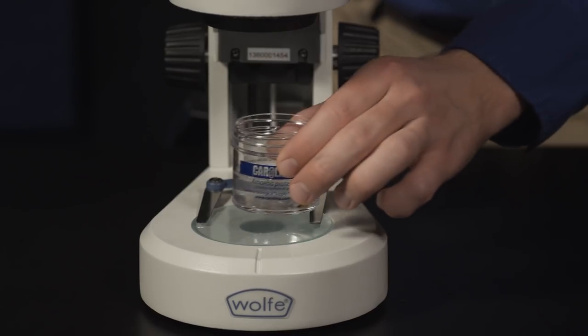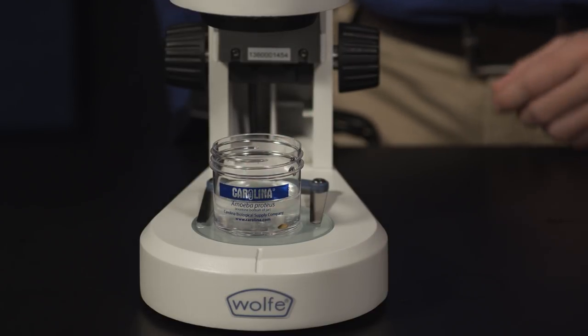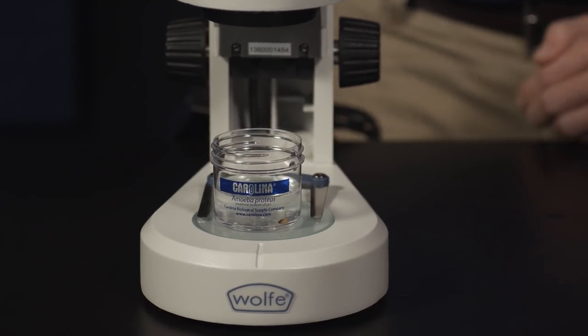Gently place the culture jar onto a stereomicroscope and scan the bottom of the jar. You should be able to see the amoeba slowly moving along the bottom of the jar. Once you have found your amoeba, you can prepare a wet mount slide for more in-depth viewing.